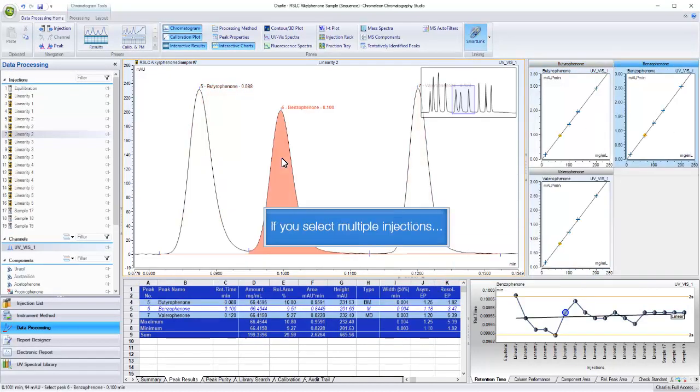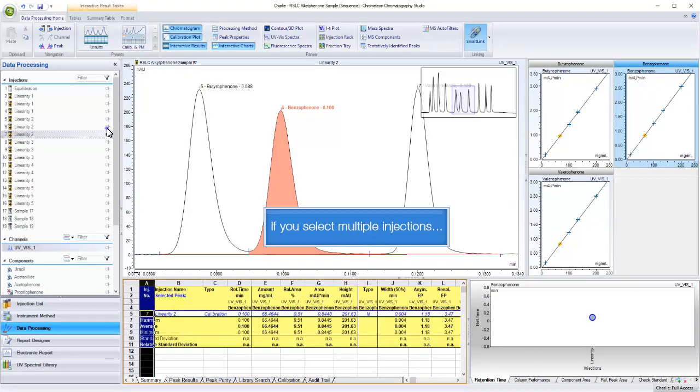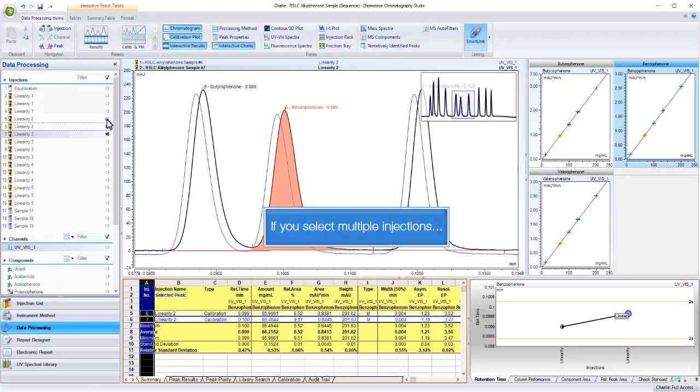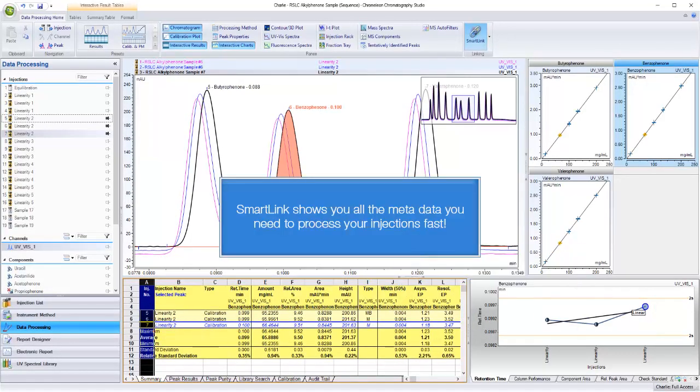If you select multiple injections, the panes show data for just those injections. SmartLink shows you all the metadata you need to process your injections fast.